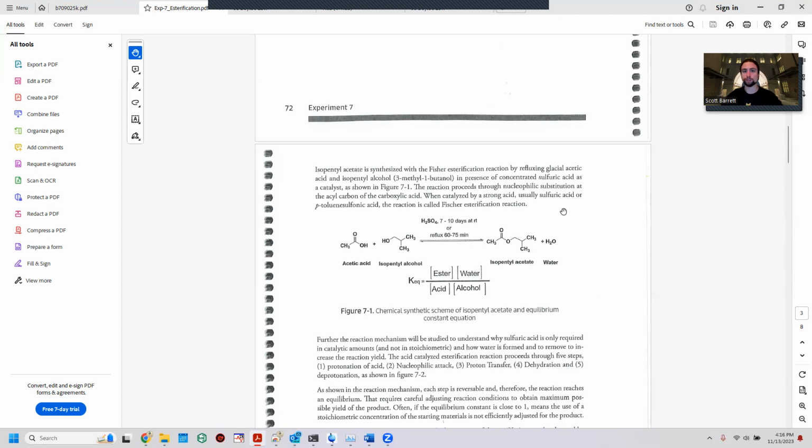lose the hydroxide group. So for instance, if you potentially ran an IR on your crude product and maybe you had a little bit of isopentyl alcohol left over, you might end up seeing an alcohol peak and then also a carbonyl peak because you'd have two mixtures together. But in this case, we went forward and did a good distillation to isolate that isopentyl acetate. You should see no hydroxide peak. You should only see a carbonyl group and then some subsequent fingerprint region for your carbons there.